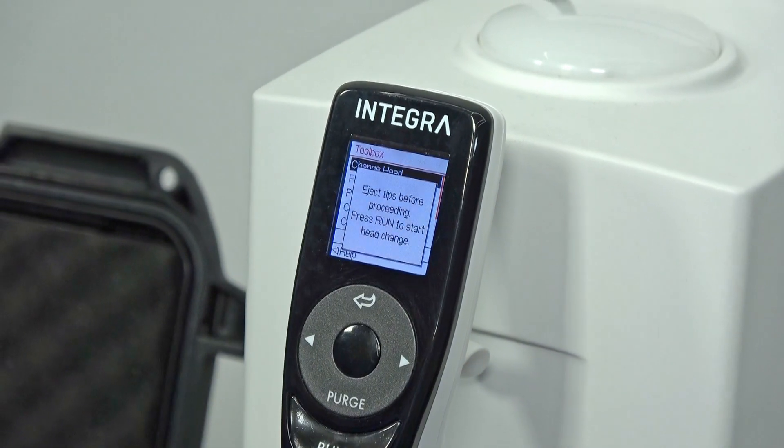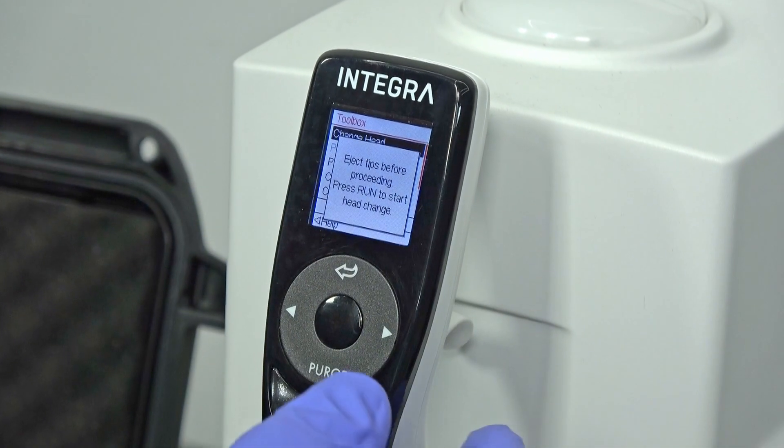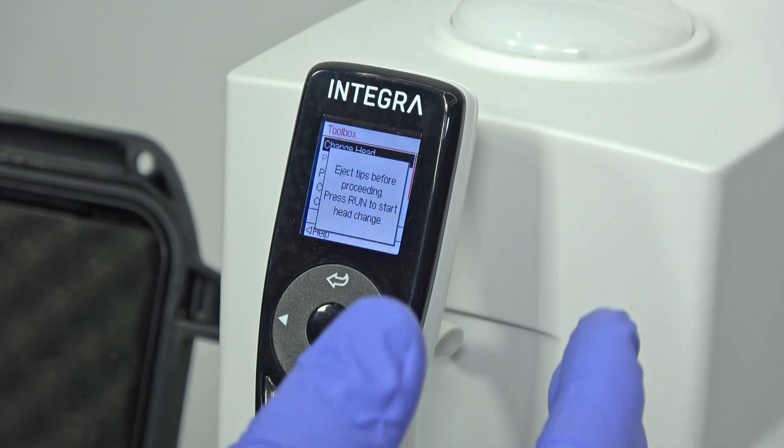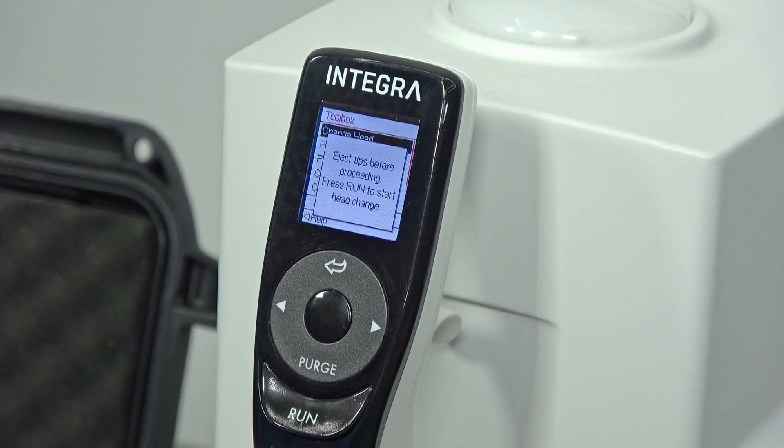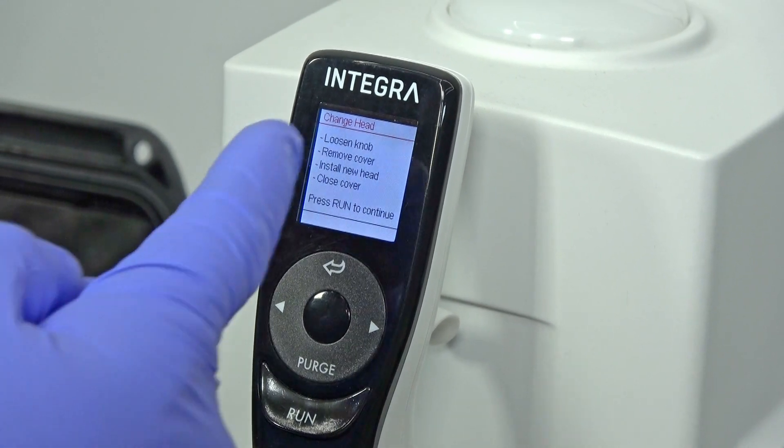Then push run. It says eject tips, there's no tips on it but we don't have any head. Then push run and it'll initiate positioning for a head change or head installation. So there we go, it says loosen knob, remove cover, install new head, and then close cover.